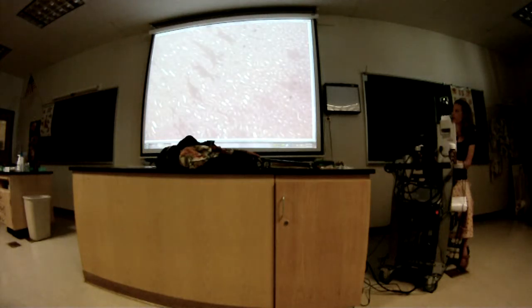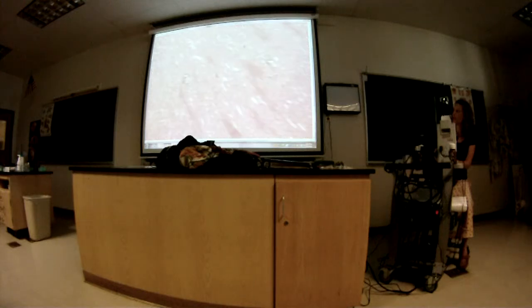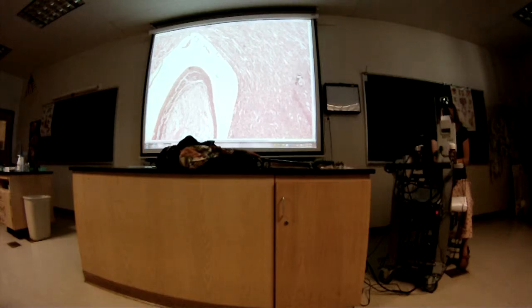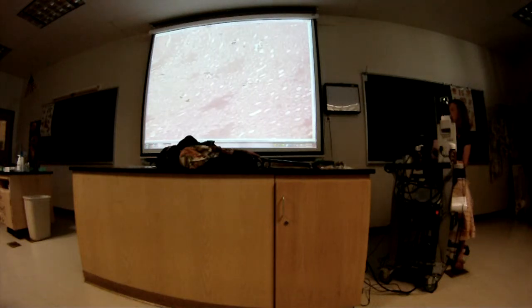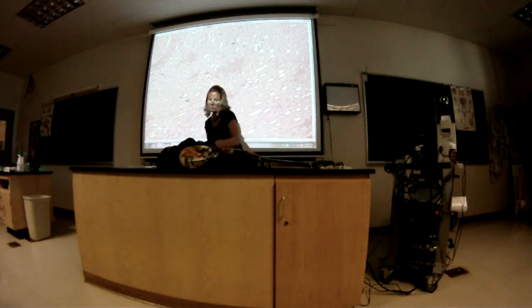All right, and so here it changes. A little bit of fat there that came along when they sectioned the kidney. So go right into the middle. What is this general region of this organ that we're seeing here? Renal medulla. Yeah.